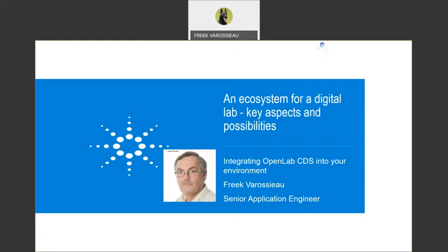I'm an application engineer and I'm supporting customers in the area of OpenLab CDS, the integration to LIMS systems and reporting. The subtopic for today will be integrating OpenLab CDS into your environment, in other words, into your entire laboratory automation.